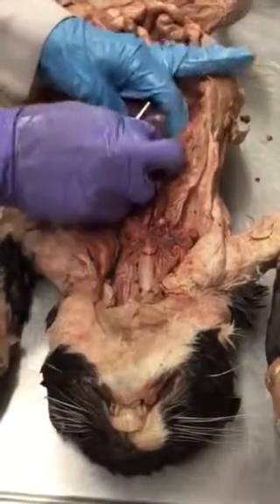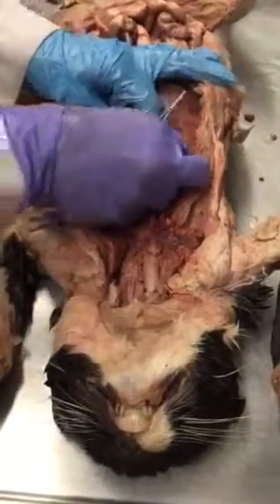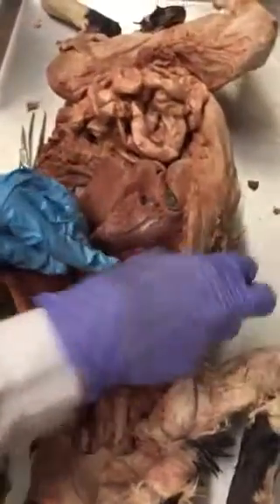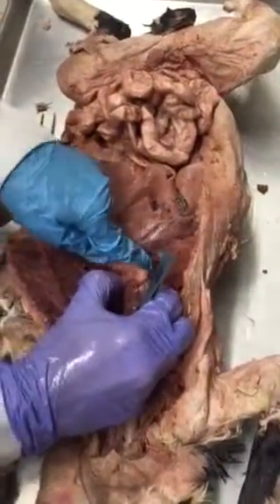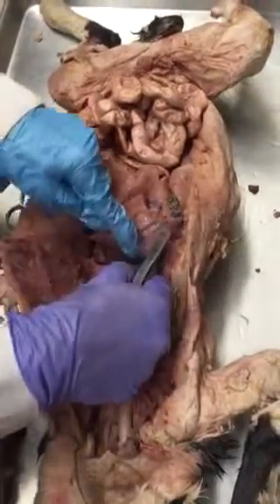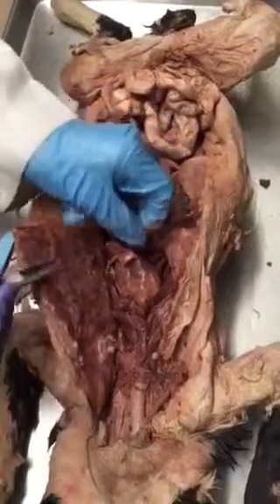Sometimes we can get lucky. Down under here, I didn't do this earlier. Sometimes we can get our inferior vena cava down here. Maybe we'll find it further down. Anyway, what's this structure right here?